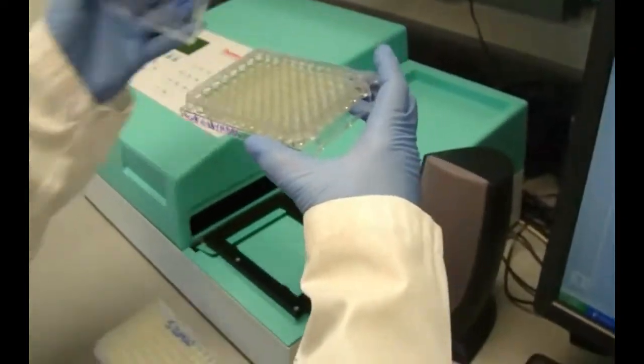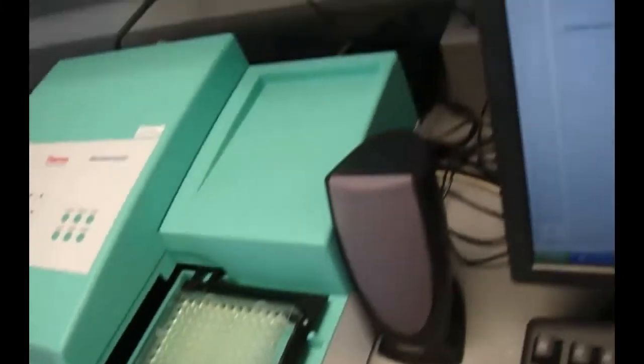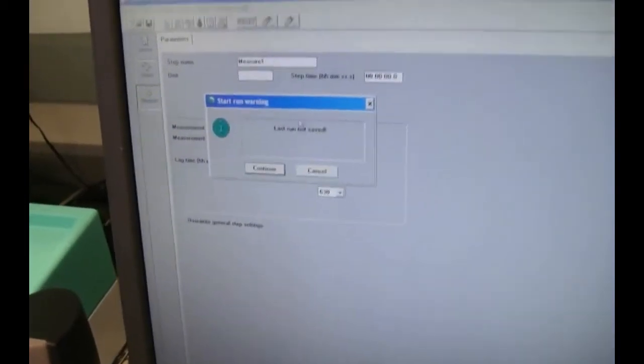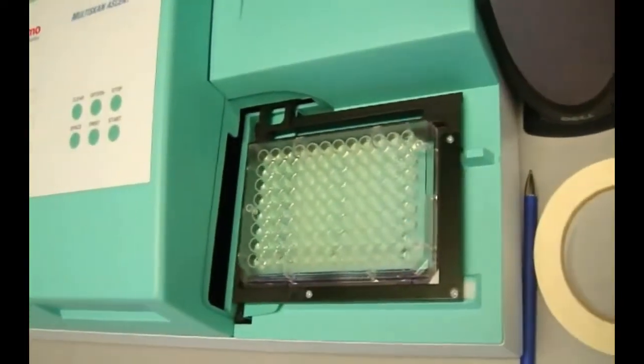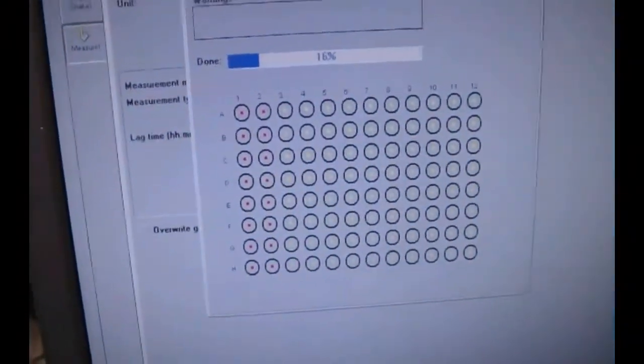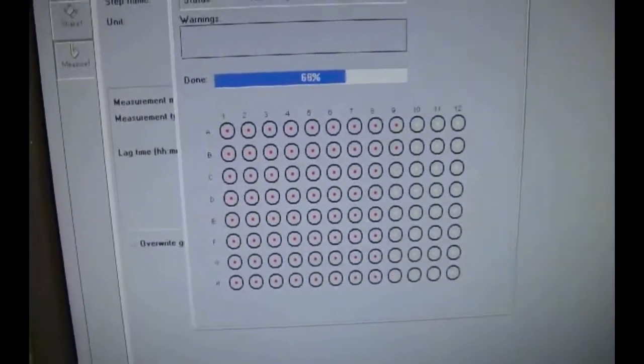To determine the minimum biofilm eradication concentration values, the wells of the recovery plate are visually checked for turbidity. Alternatively, a microtiter plate reader may be used to obtain optical density measurements at 650 nm. The MBEC value is the minimum concentration of antibiotic that inhibits growth of the biofilm as indicated by a well with no turbidity.